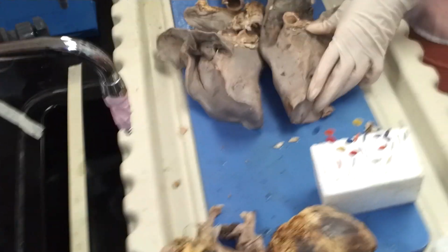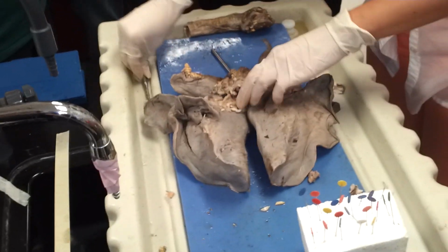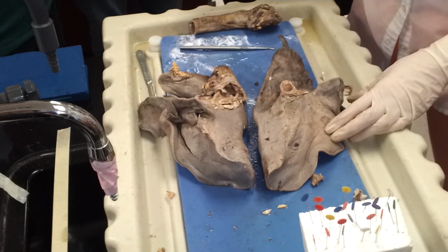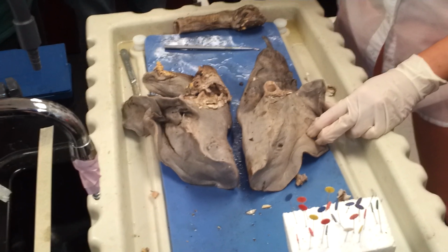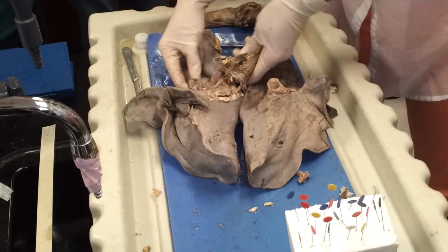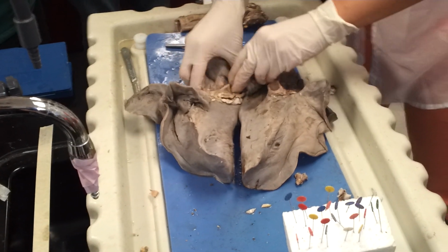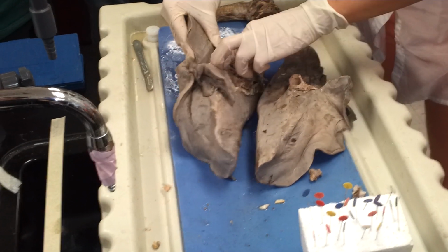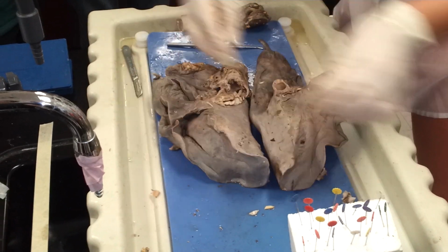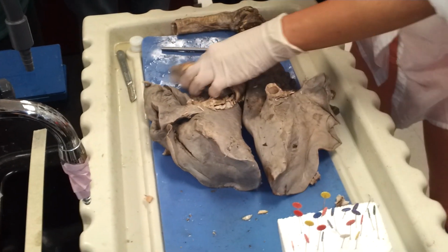All right. So how do we know right versus left? The lobes. Lobes. Okay, so the right has how many lobes? Three lobes. So here's one. Don't worry about these. Here's one, here's two, and here's three. Okay, so this is how we would ask.